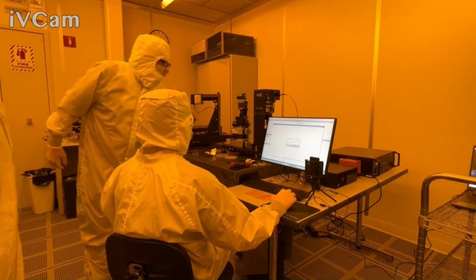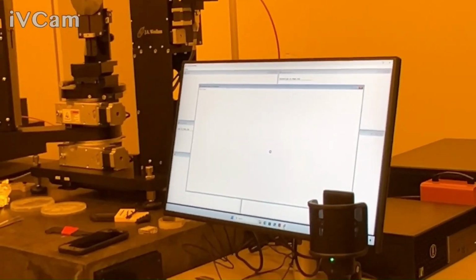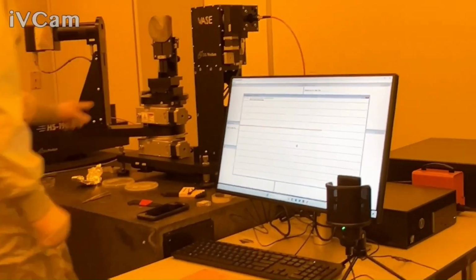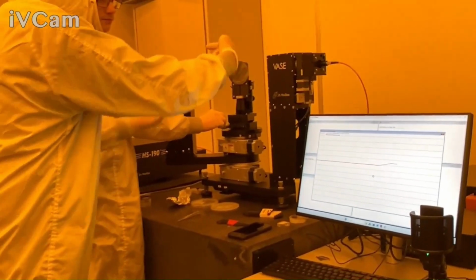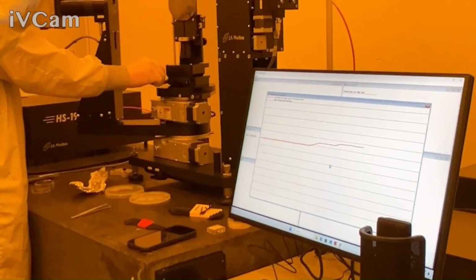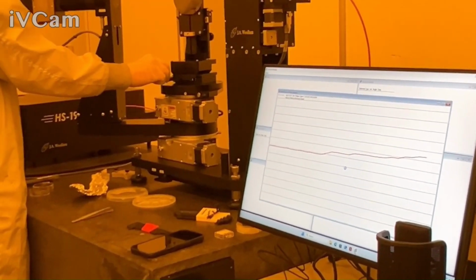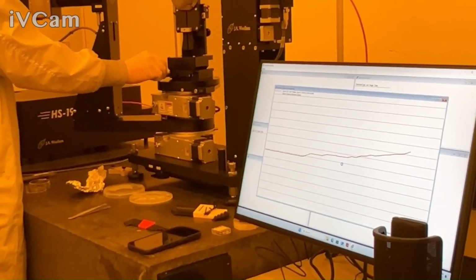So now it's going to say maximize the height. Basically, this is going to be the micrometer adjustment. So say okay, and it'll show you your intensity screen. Adjust this. What's happening right now is the tip tilt is correct. So we know that. But if your sample was thicker or thinner, you're going to move the reflection of where the height of that surface is to get the maximum signal into the detector. So you're getting the sample height correct now.